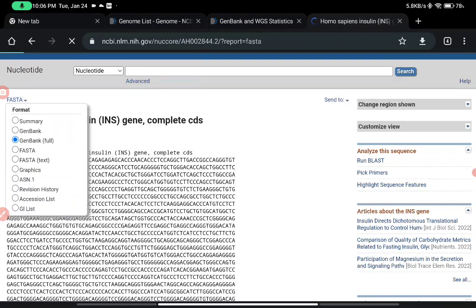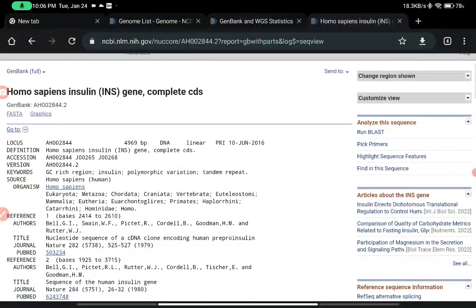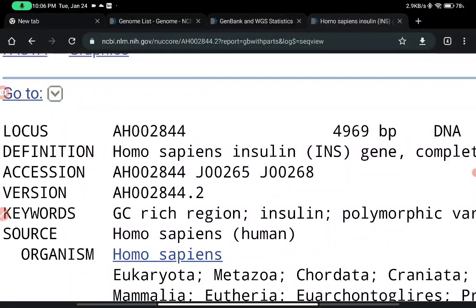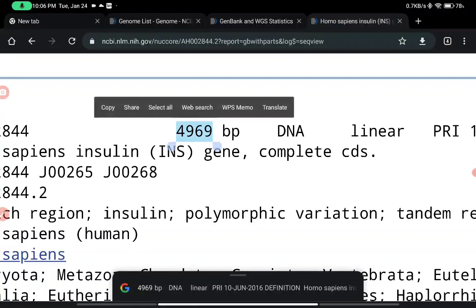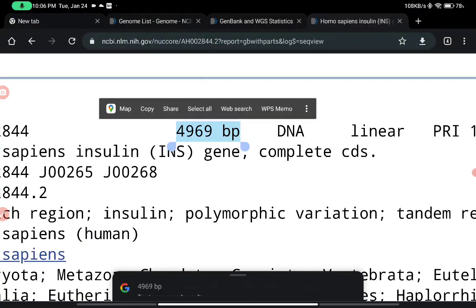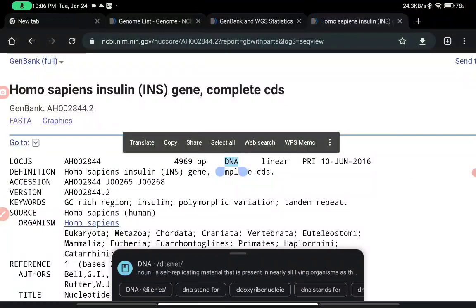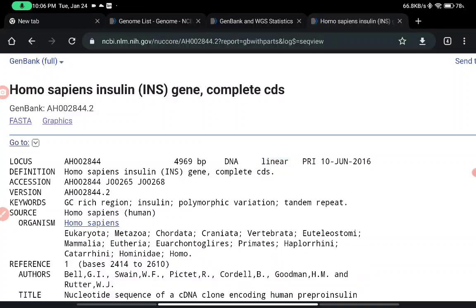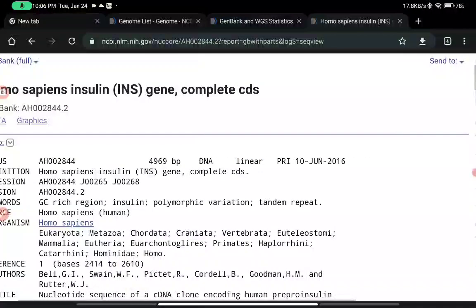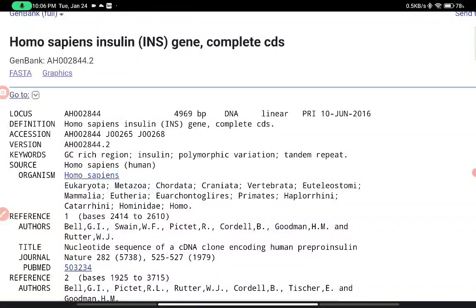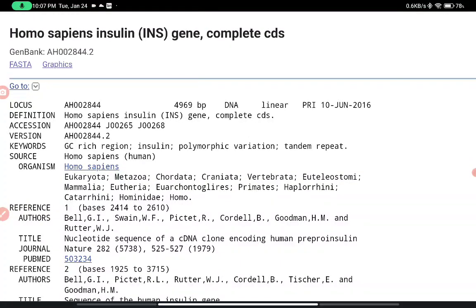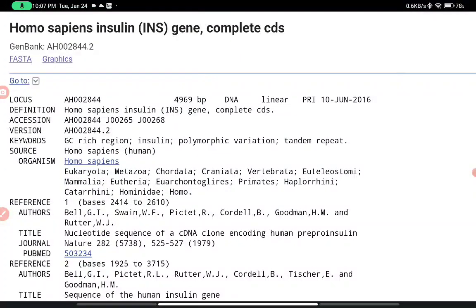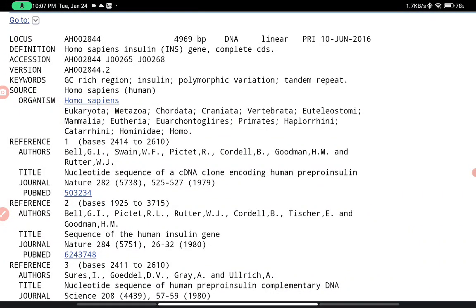We can change the format by clicking on 'GenBank (full)' to get complete information. In the GenBank format, the first thing is the locus number, along with the size of the sequence — it is 4969 base pairs. The type is DNA, and it is a linear sequence from primates. The date is also given, followed by the definition of the gene — Homo sapiens insulin gene — then the accession number, version number, and key terms such as GC-rich region, insulin, polymorphic region, and tandem repeats.